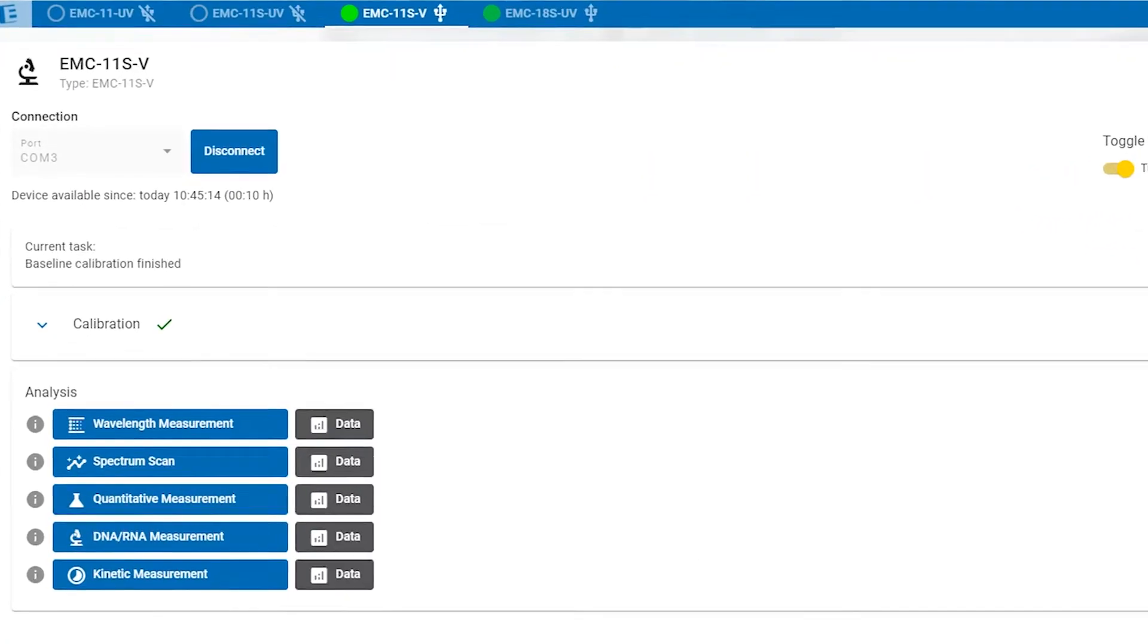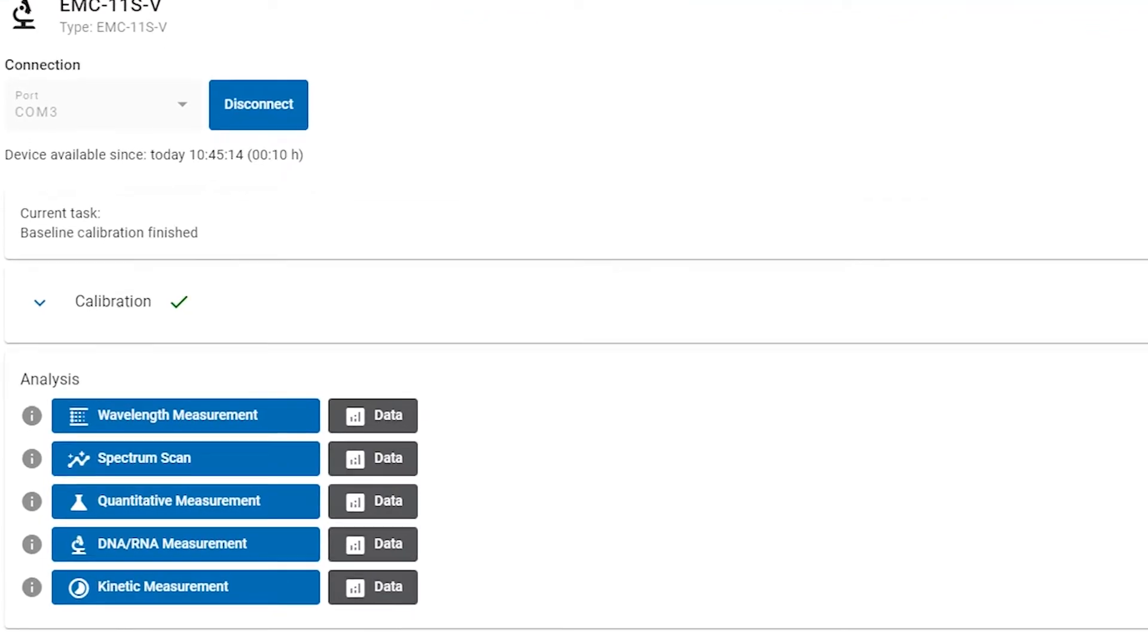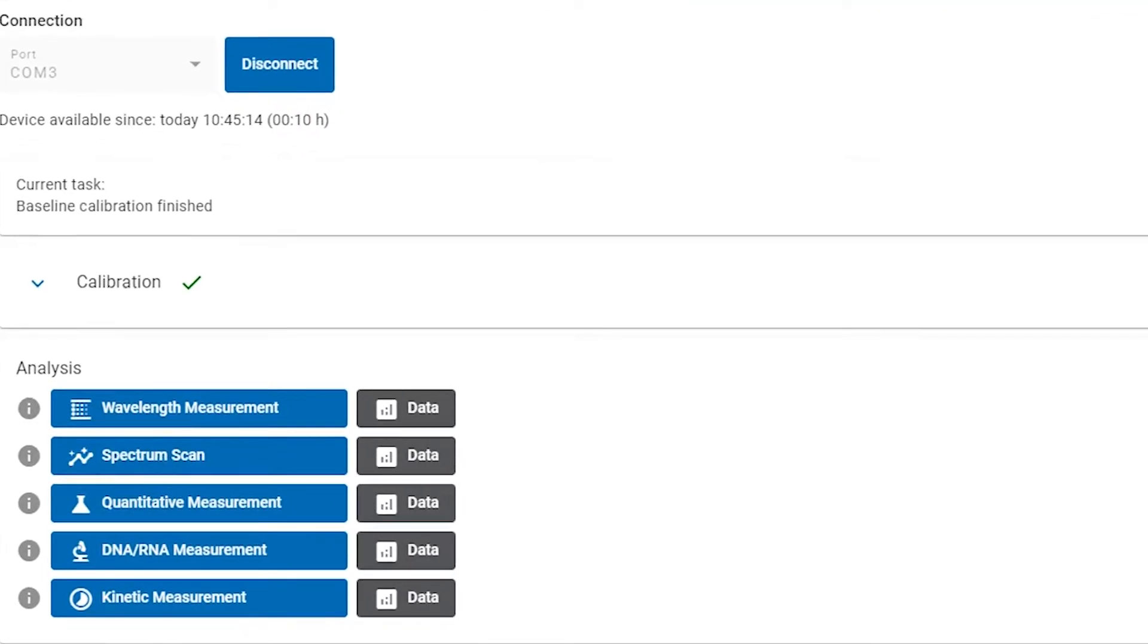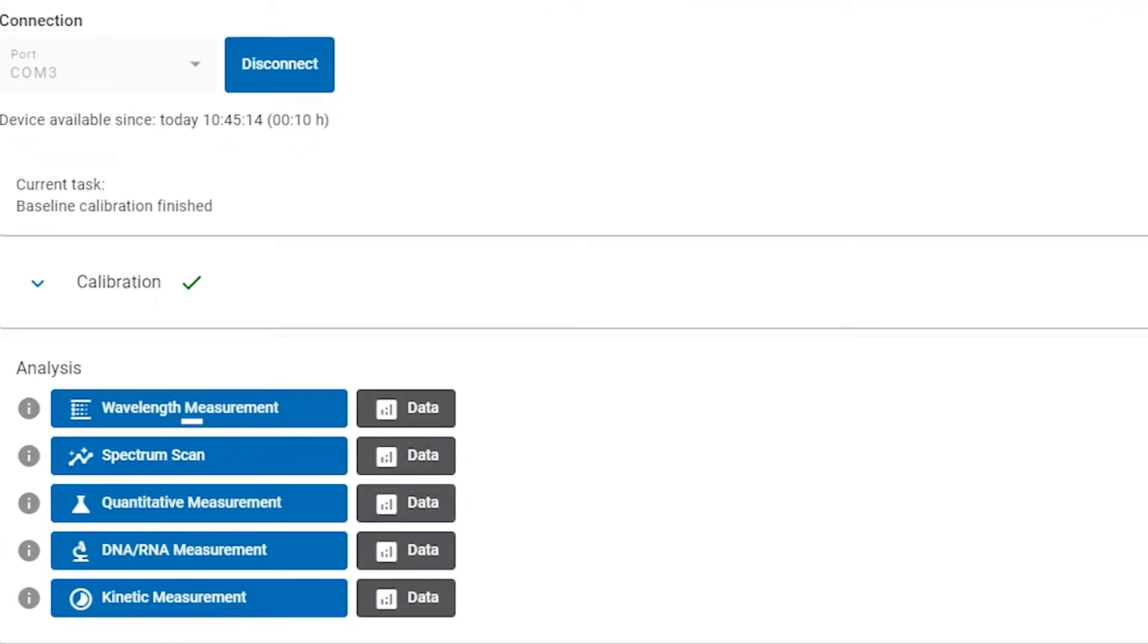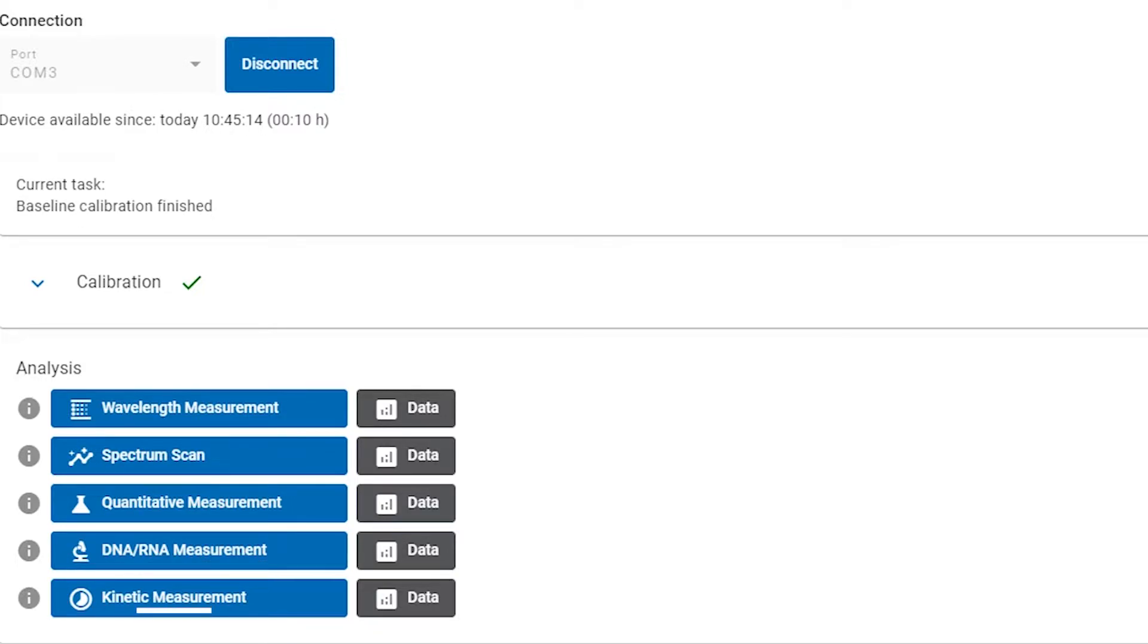Next you can choose between five different activities: wavelength measurement, spectrum scan, quantitative measurement, DNA and RNA analysis, and kinetics.